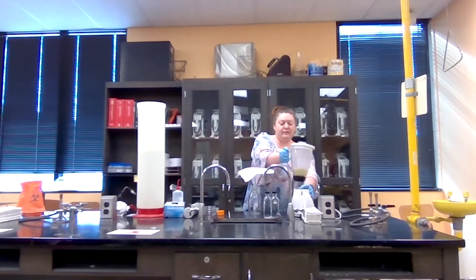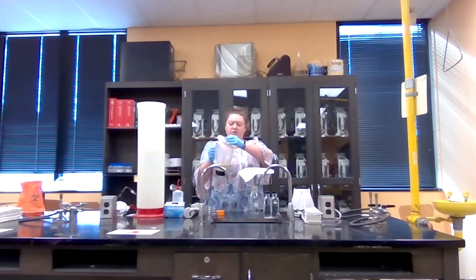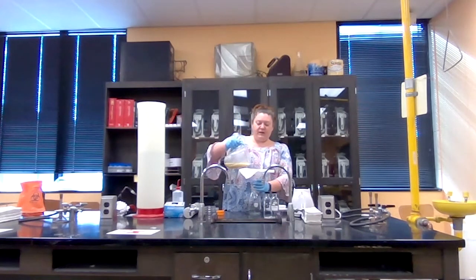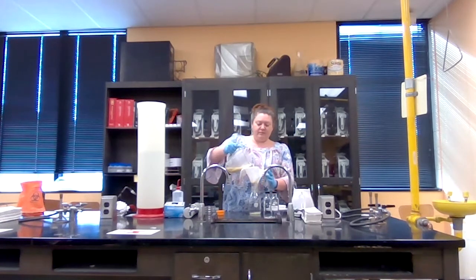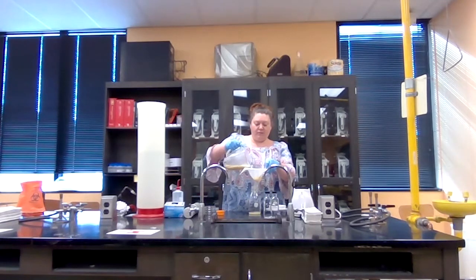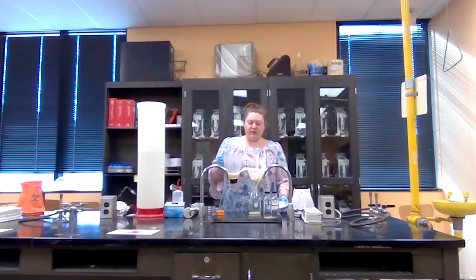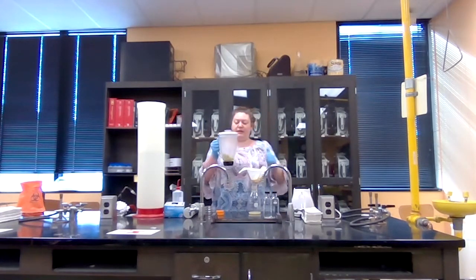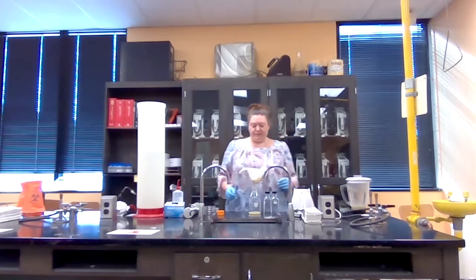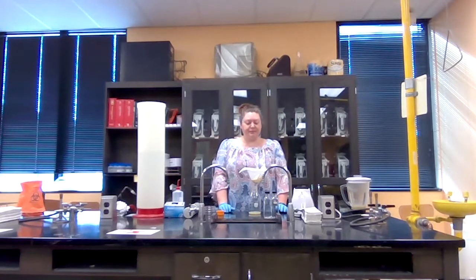Okay. And we have our slurry here, our Taco Bell delicious slurry. So I'm going to pour some of it in here. There we go. And we don't need a whole lot of this because we're not going to need a whole lot to put into our petri dish plates. So we can set this aside. Let that drain a little bit.